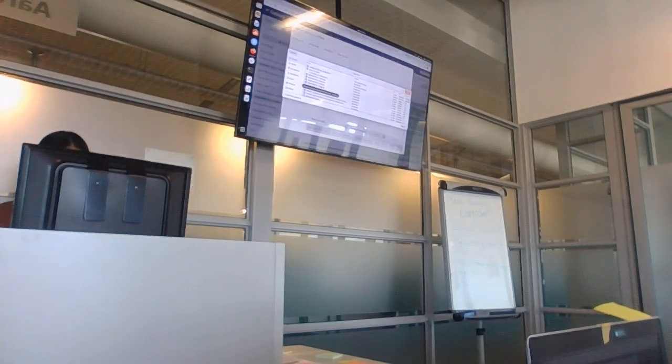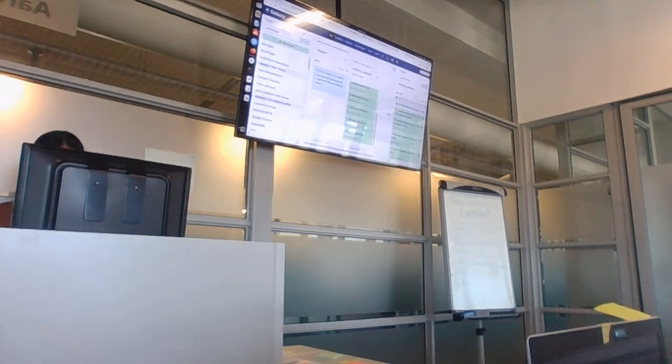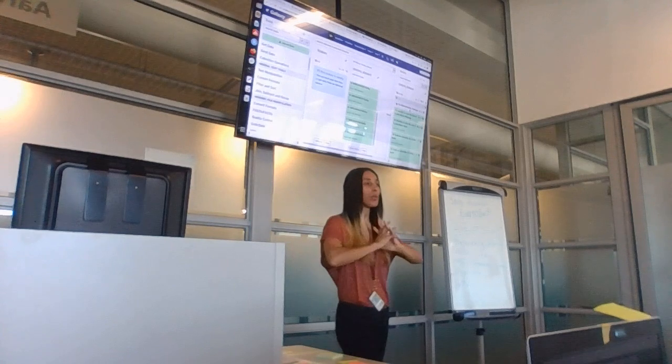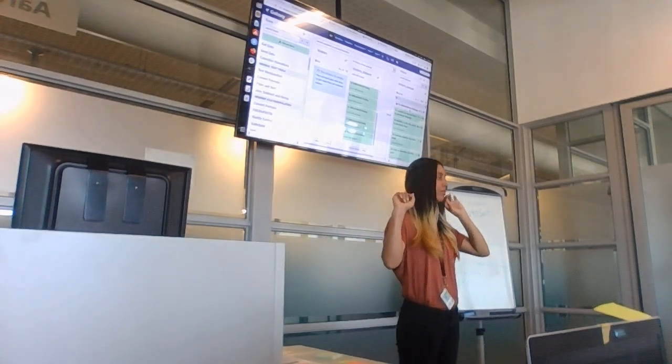Load it. Close it. Just going on. No, you must upload it to the color of it. Remember she said you must load it, so you press switch to. Yeah. If anybody's stuck with that part, please put up your sticky note. The red one.